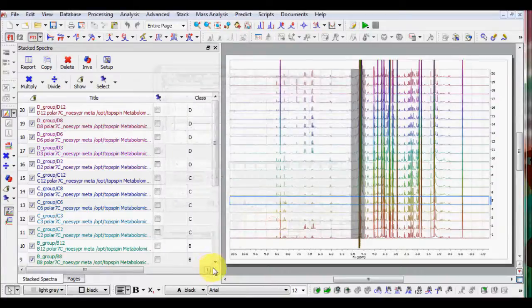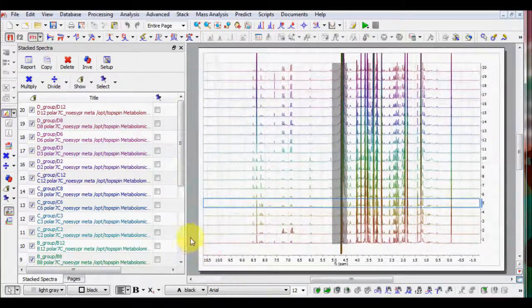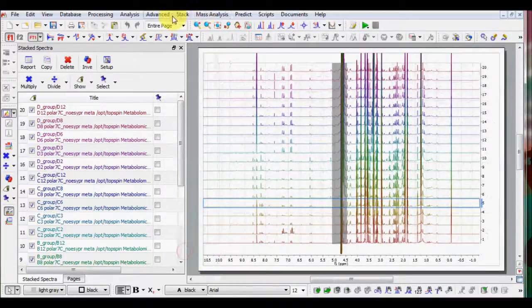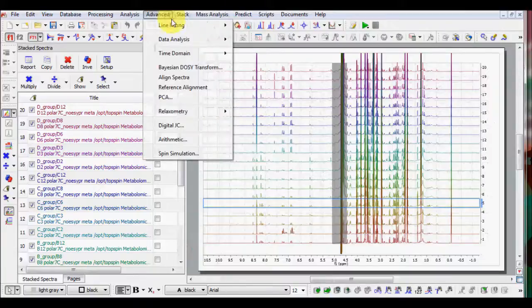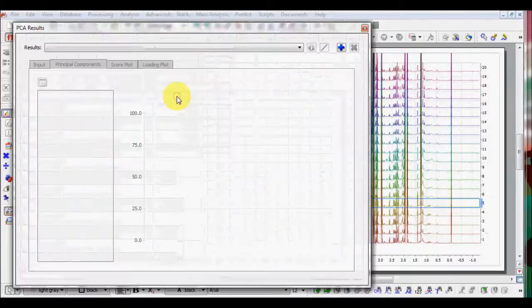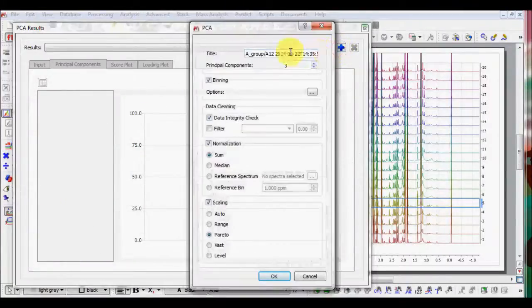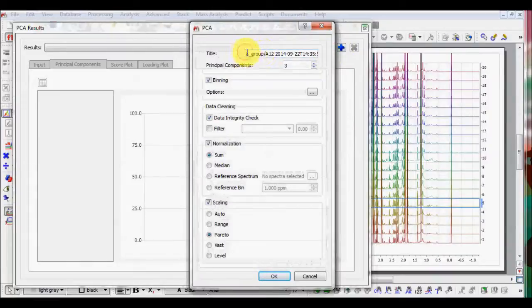Now, to start PCA module, go to Main Menu and select Advanced and PCA. Select the plus button to start a new analysis.